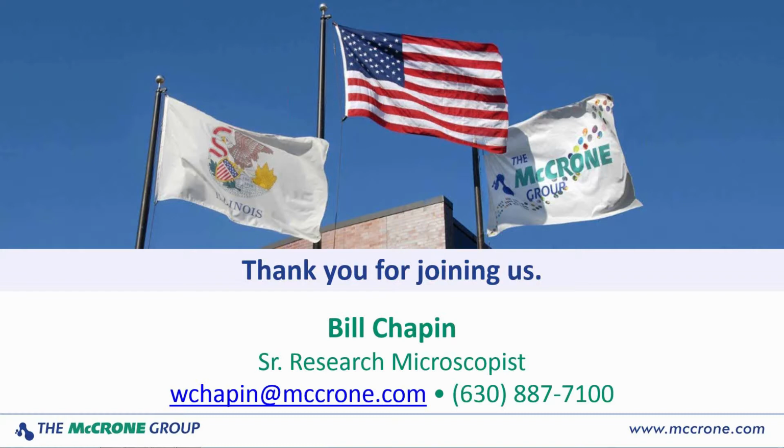Chantel wants to know what we use as the organic adhesive. We use something called soluble gum that is not available publicly. We bought that years ago, and I don't believe that you can get it. You can use a rubber cement, anything like that that you pre-test. I think rubber cement is what we've used. We use that in some other applications.